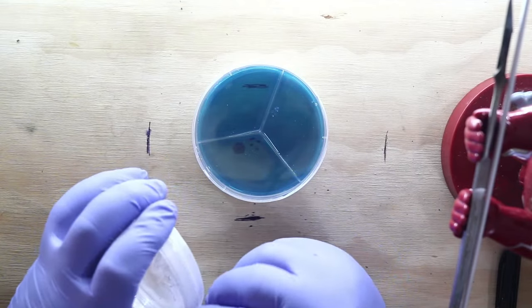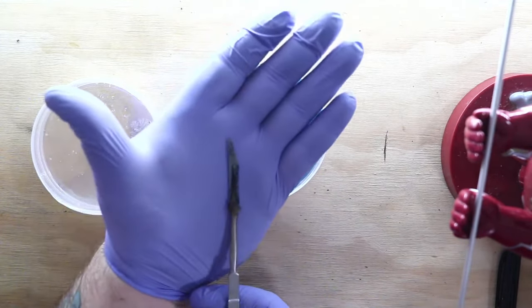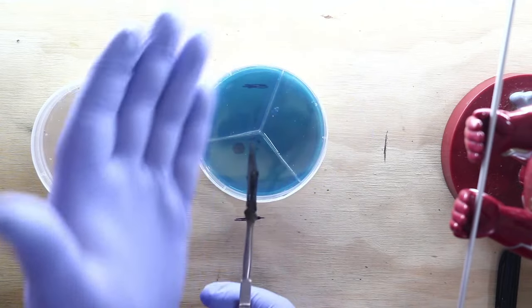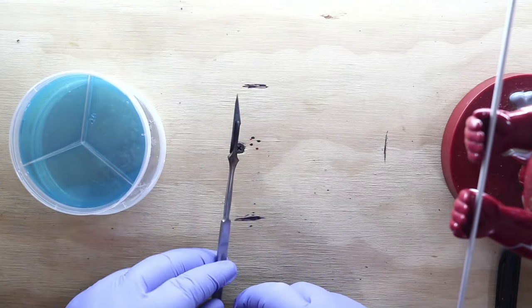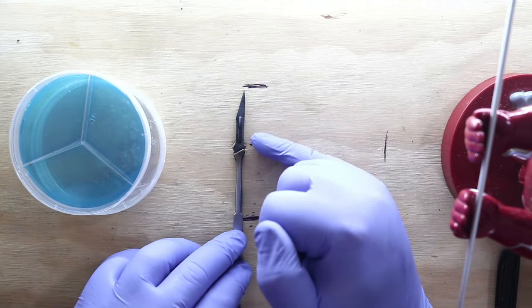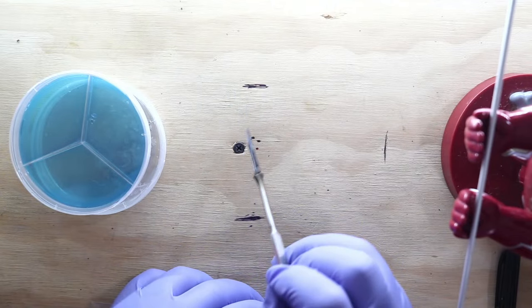It's like, for instance, I use the number 11 blade there. Can you see that? Yeah. How about now? Go down. There you go. Okay. I like the number 11 blade. It's this real sharp angle, almost like a spear point. I like that because it is both a spear and a cutting device.